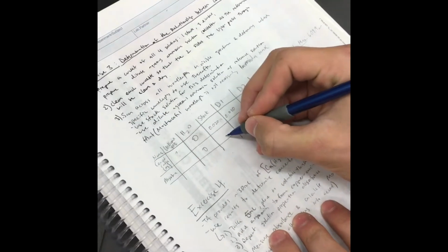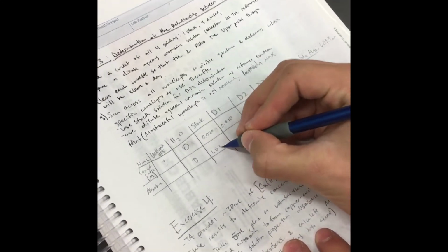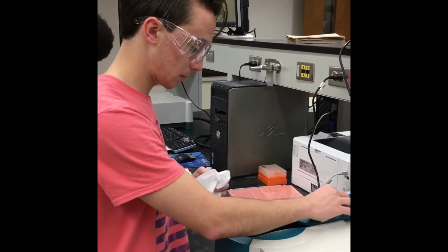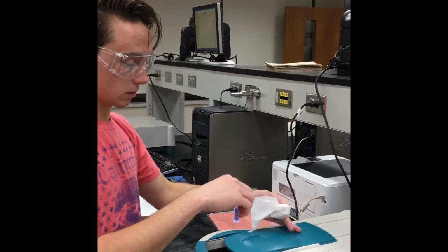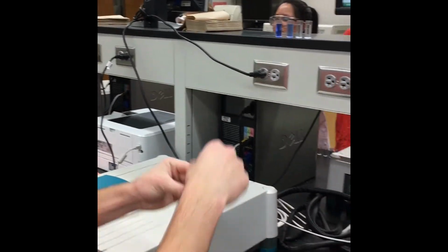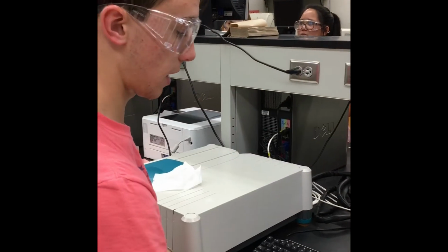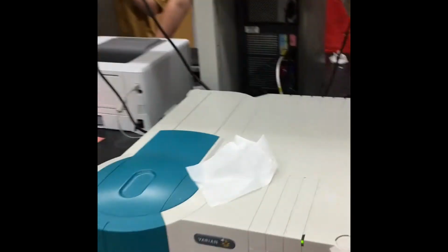Here we have Trevor recording the absorbance of the stock into a notebook, taking out the sample, and then cleaning up all of our materials since we are done, and closing out of the program.